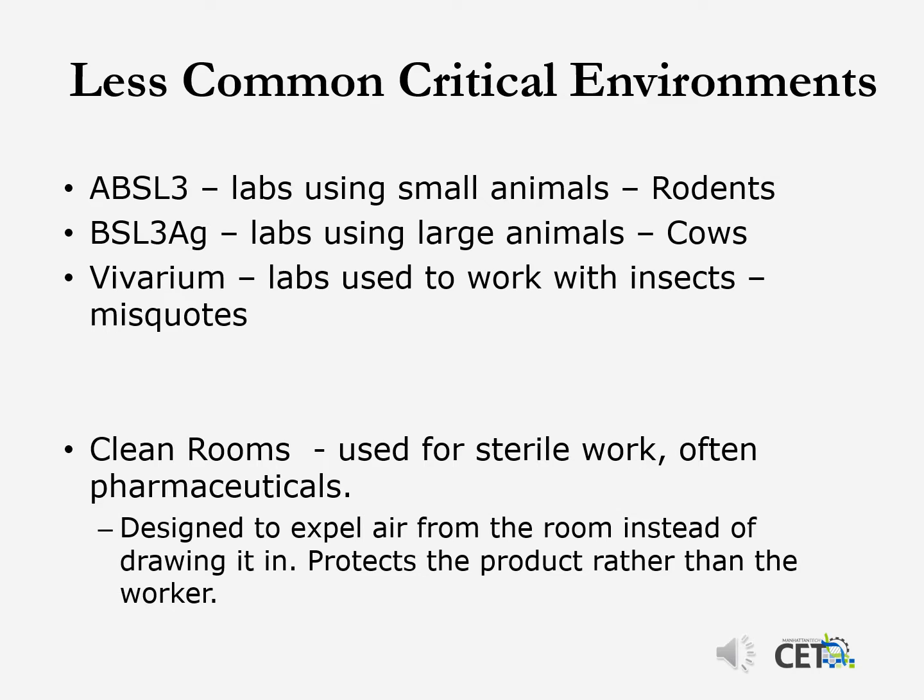Vivariums, those are areas where insects are worked on. So you can imagine the precautions taken to keep the insects with the disease inside the lab. But there are other rooms. Clean rooms are different. Clean rooms have air flow that is moving out of the room to protect the sterile areas in the room from contamination.